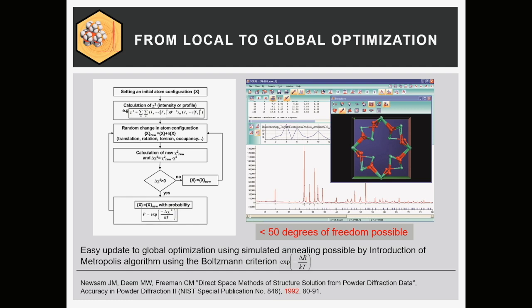From there, you start to do smaller moves, and you accept the worse chi-squared with a lesser probability, and this probability is basically a Boltzmann function. In the Boltzmann function there's a temperature, and therefore it's called simulated annealing. Okay, it's not a temperature; it's just a parameter T. But we call it temperature. Therefore it's called simulated annealing.